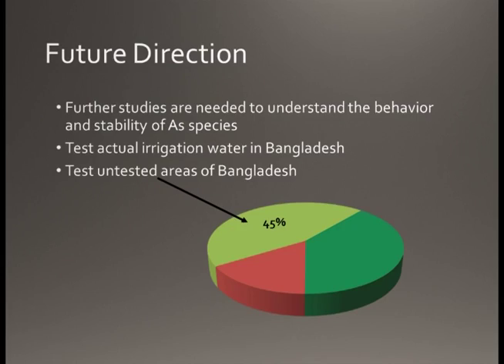For their further direction, they want to do further studies to understand the behavior and stability of arsenic species, specifically to understand the partial oxidation of arsenite.